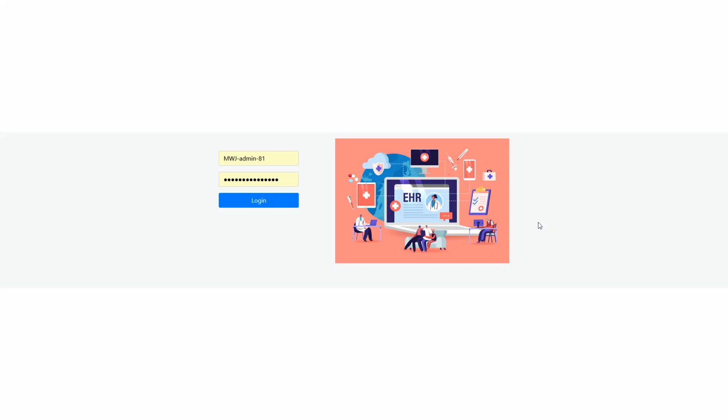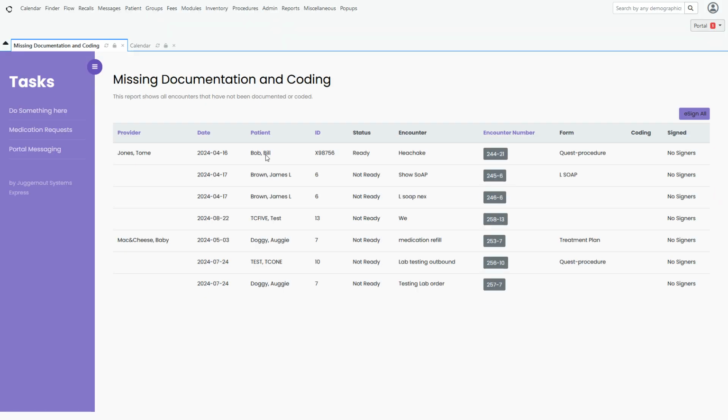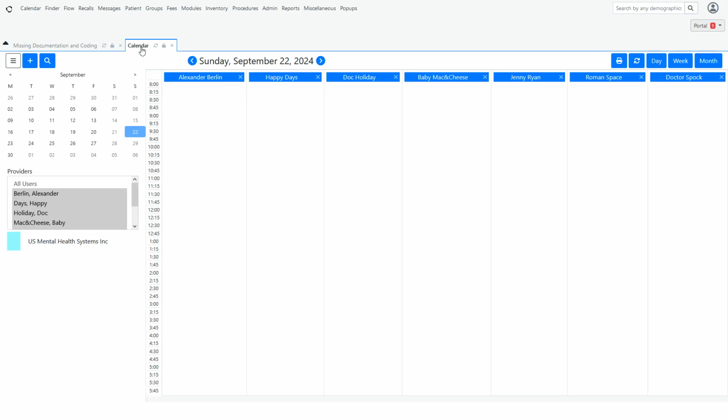It was brought to my attention that I don't have a video about how to set up or configure the lab in the program for the current version. So let's go with that. All right, let me go ahead and log in here, and we're going to jump right into configuring lab.